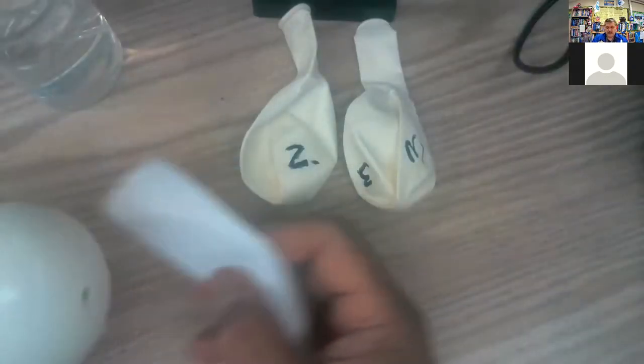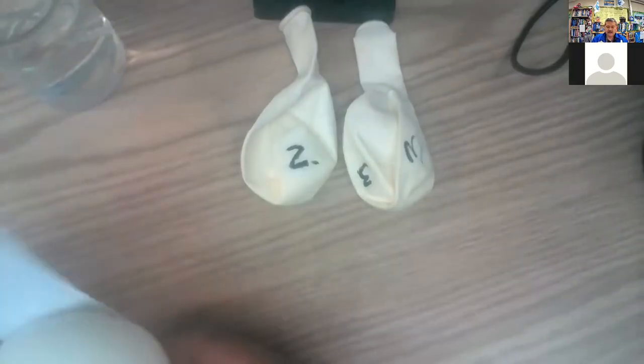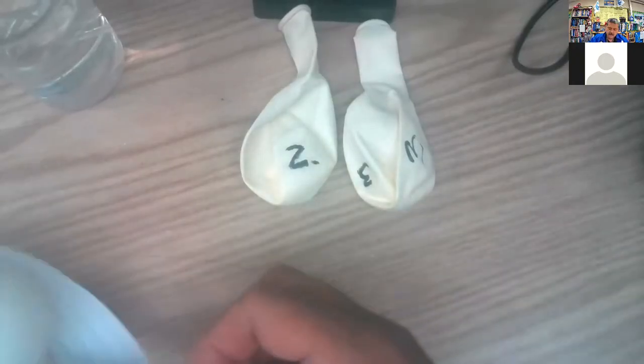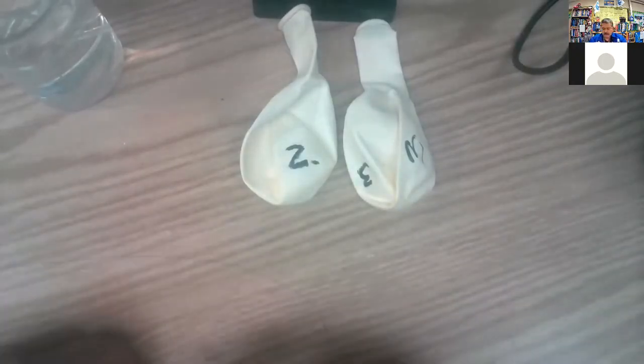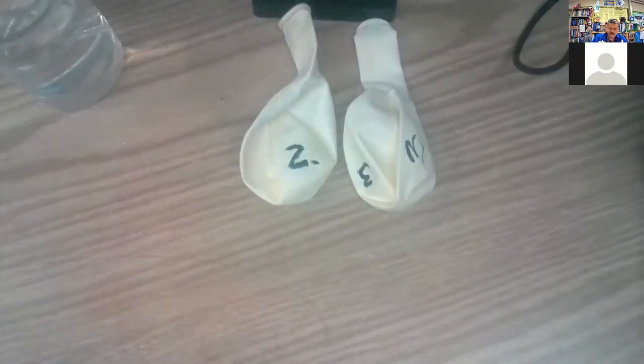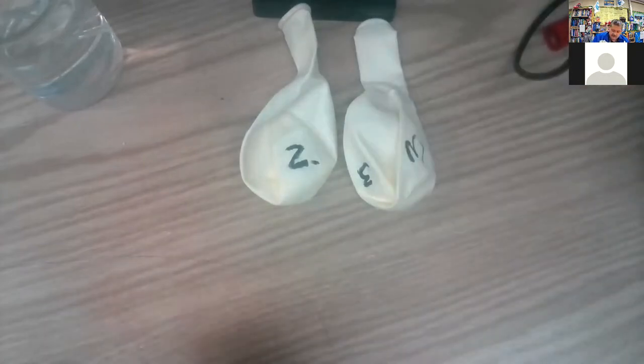I got my strip of paper ready. Measure it. This is getting wet already. So, a piece of string is good if you don't have a ruler.